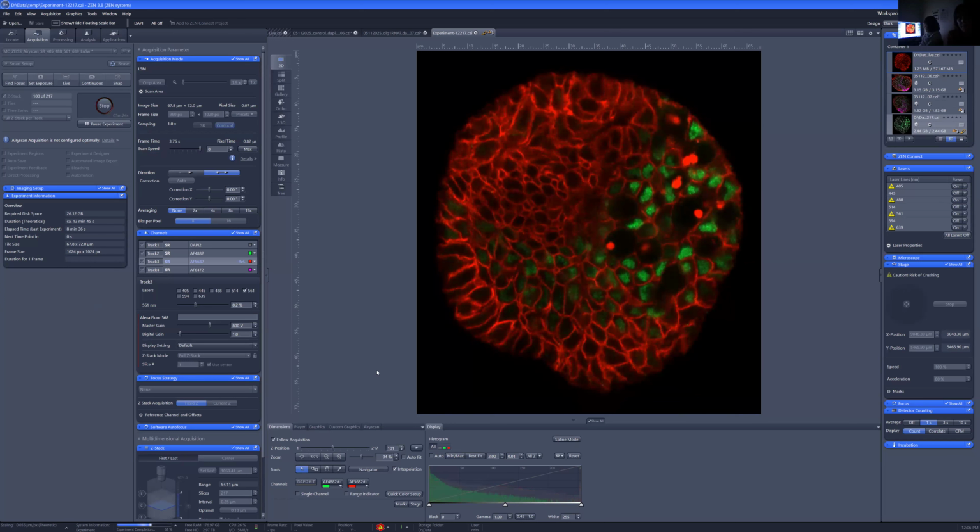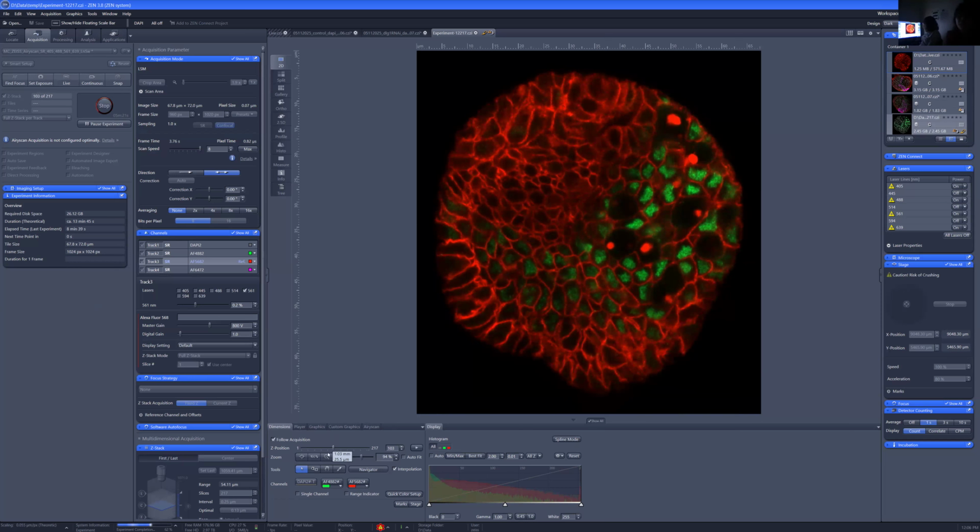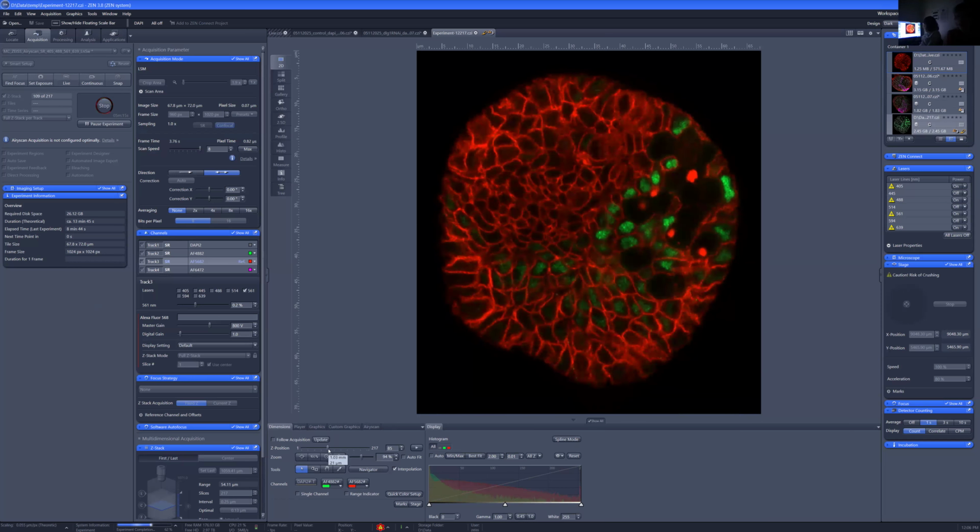Yeah. So it's good. Cool. I was worried you were gonna have to troubleshoot. I know, me too. Which happens truly all the time. While Mikala's focusing on something, I will relay.